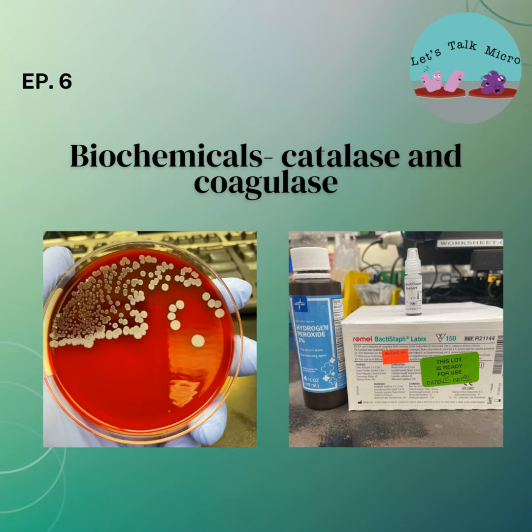So going back to the biochemicals, how are they helpful? They help us identify organisms. Organisms can have reactions to biochemicals that can be distinctive of them. For example, oxidase and the Enterobacteriaceae. Do you remember what's the oxidase result for an Enterobacteriaceae? They're all oxidase negative.